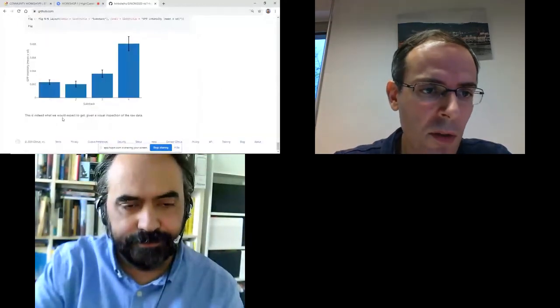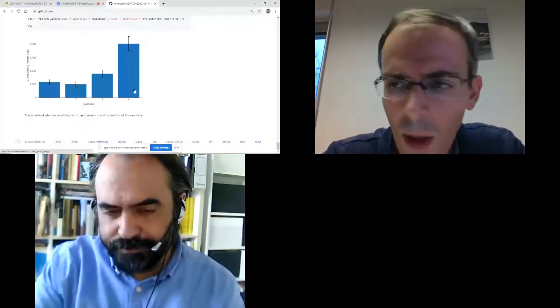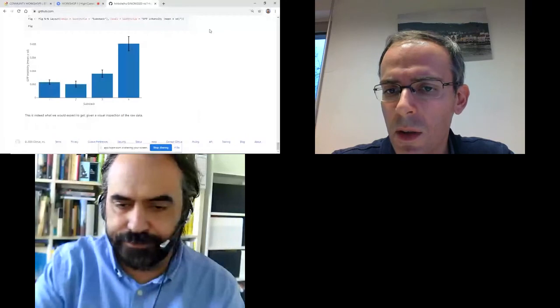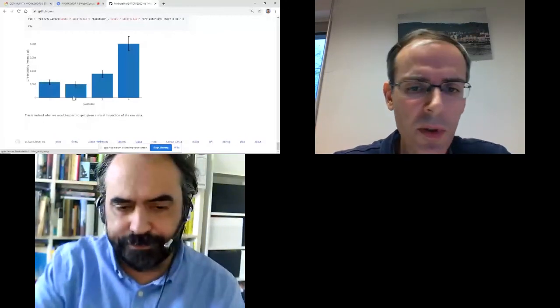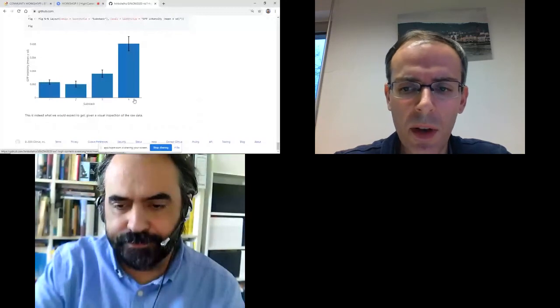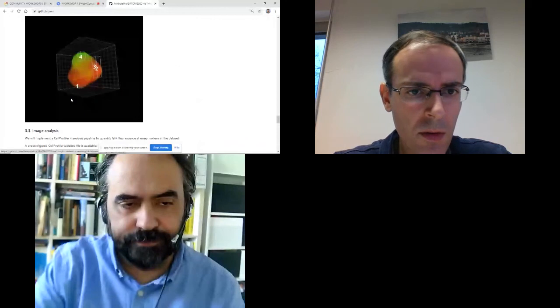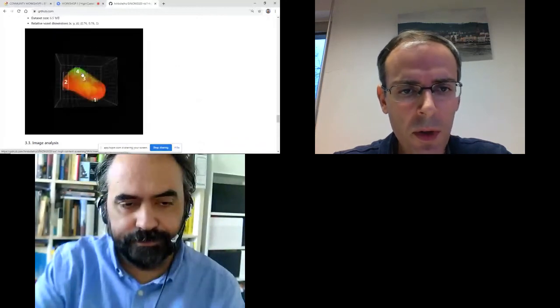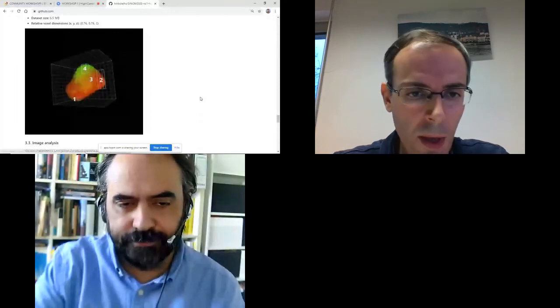And later on, you can even use maybe some R script to analyze these CSV files and plot the mean GFP intensity for each of the 4 substacks, and find out that in fact substack 1, 2, and 3 have a lower GFP signal. Stack 4 has a higher GFP signal, as one can see right here. So the highest GFP signal should be found on substack number 4.